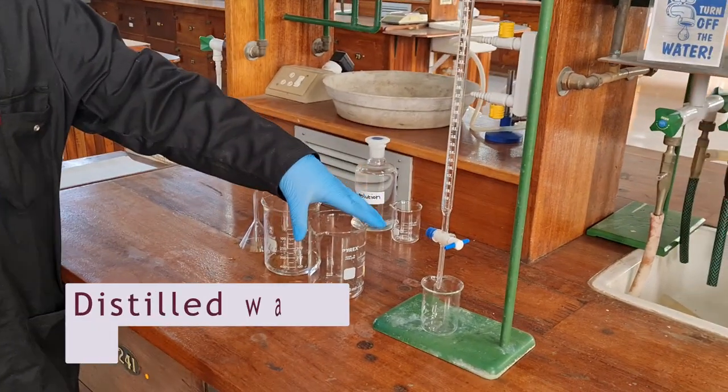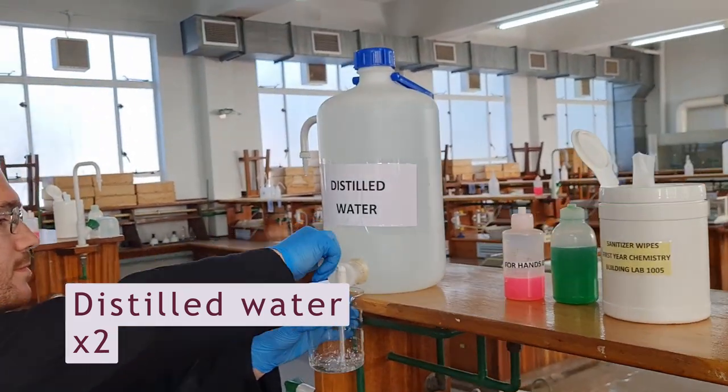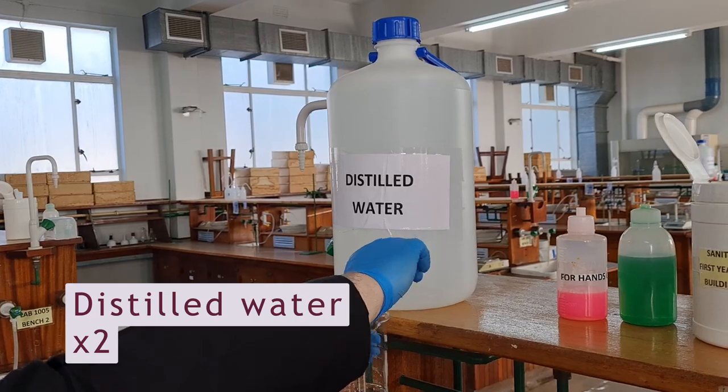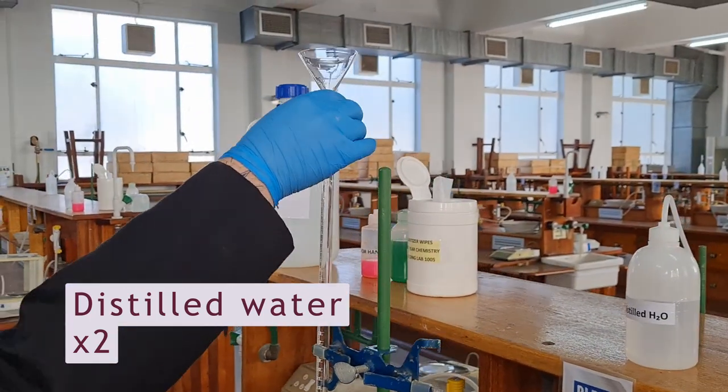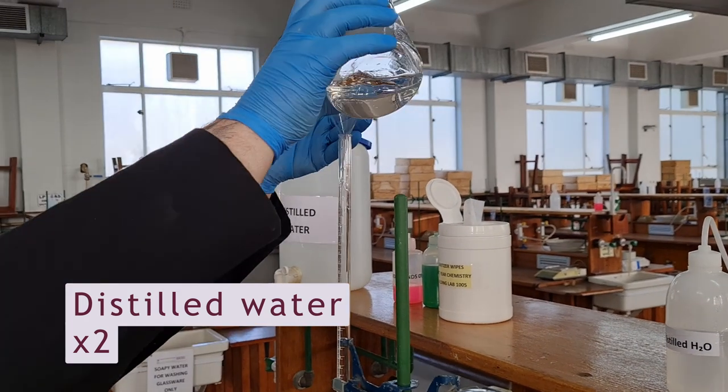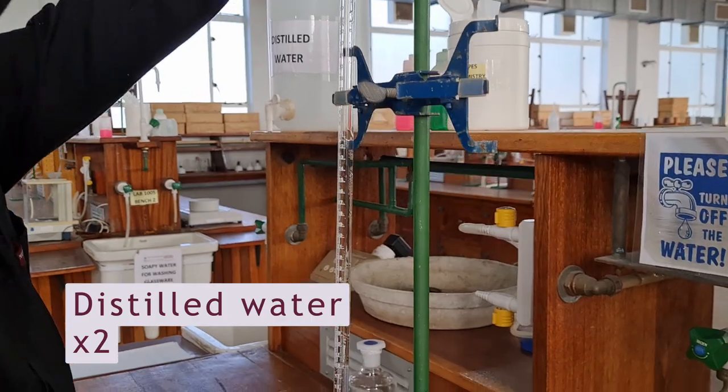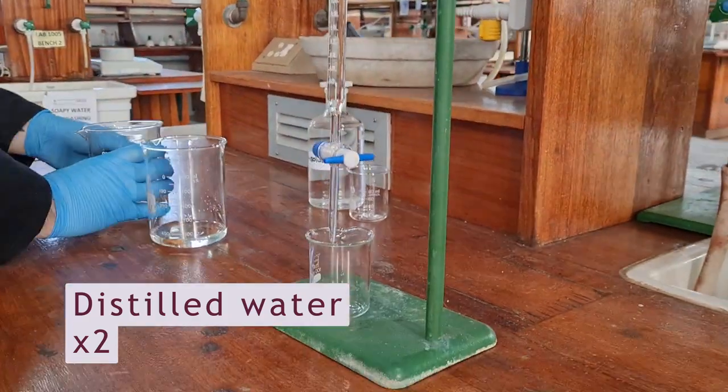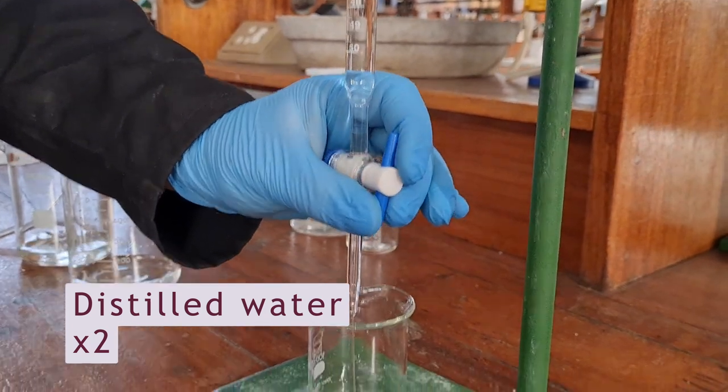Rinse the burette twice with distilled water and once with the solution you are using as follows. First, place the burette in a burette holder and make sure that the burette tap is closed. Place a funnel in the top of the burette and pour about 5 cubic centimeters of distilled water into the burette. Remember to always lift the funnel slightly to allow the solution to flow in freely.